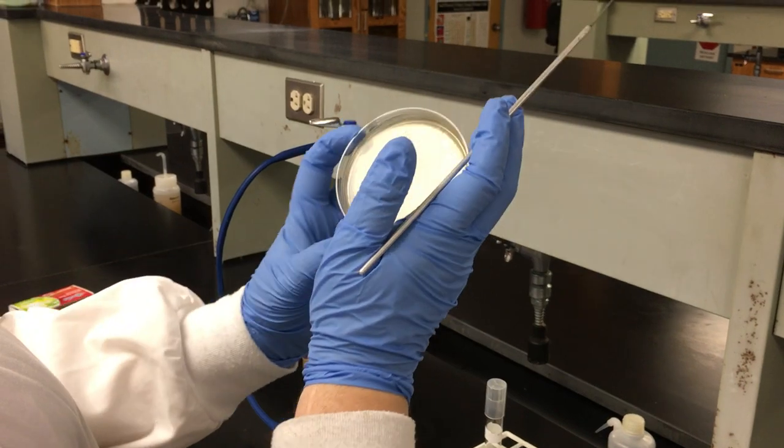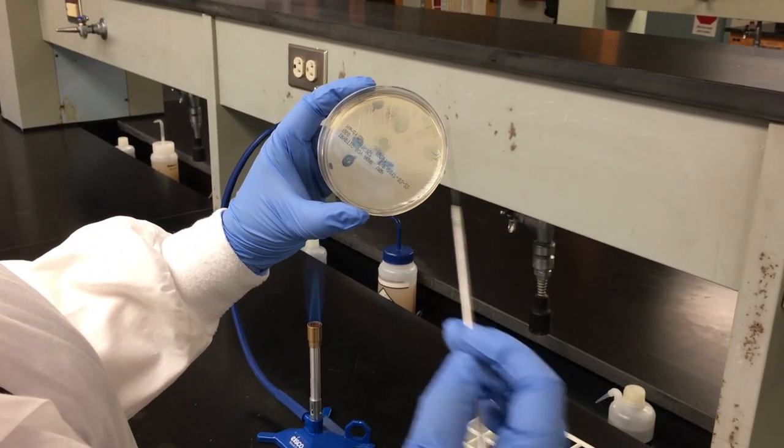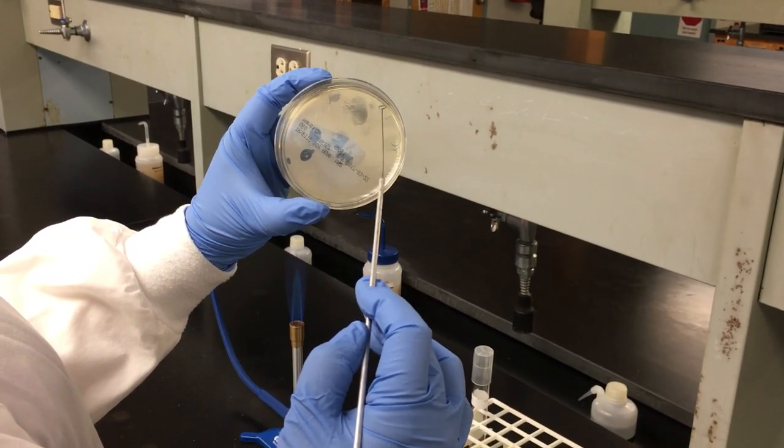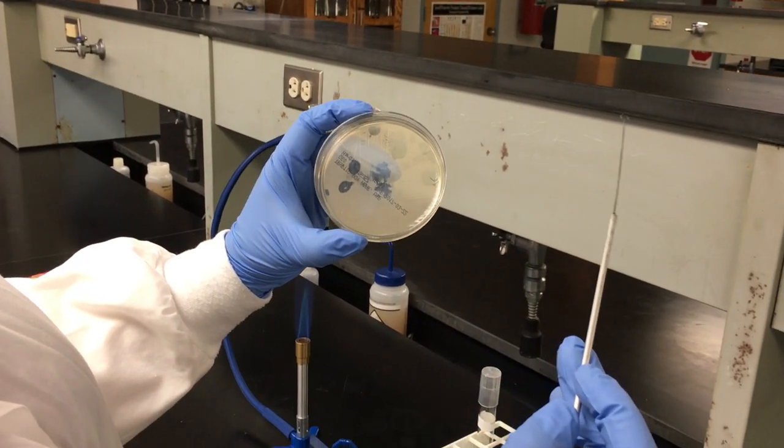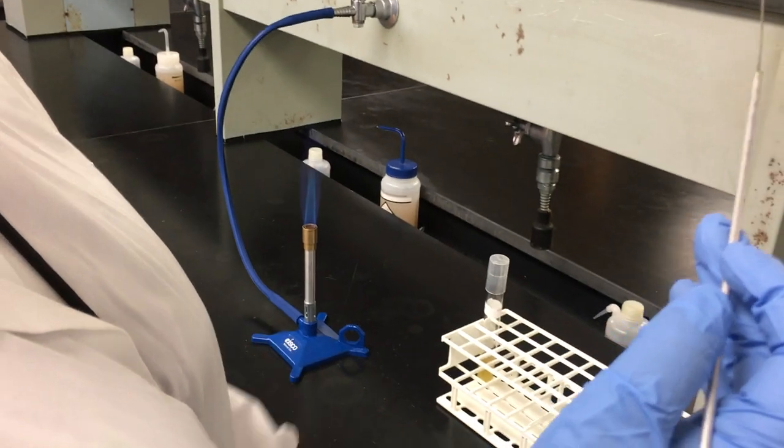Now turn your plate to the section that you just did quadrant two in. You are going to pull out of quadrant two in the last section one time and zigzag down, not going into the first quadrant, stopping before you hit the first quadrant to allow for individual organism isolation.